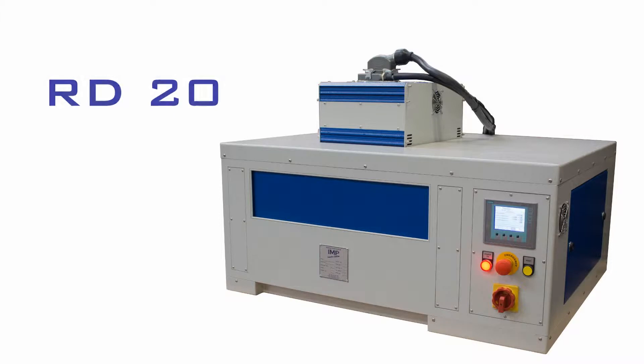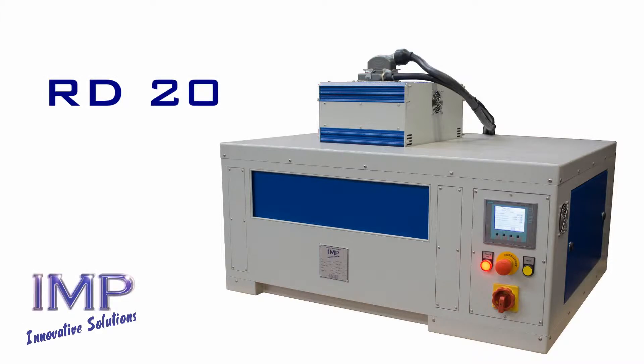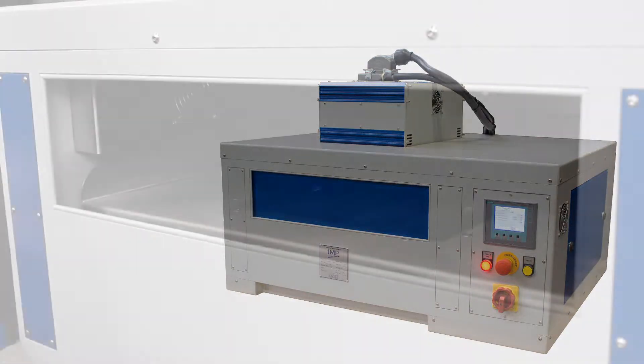The RD20 features groundbreaking technology that allows the user to monitor the weight of samples during the drying process.